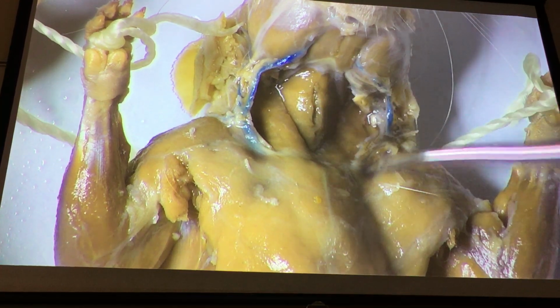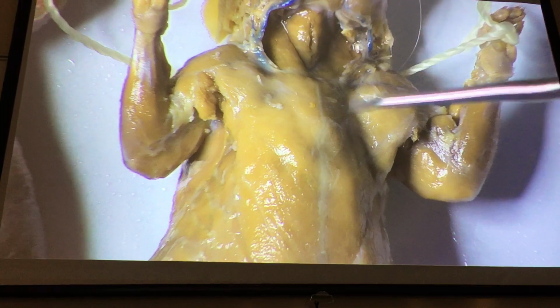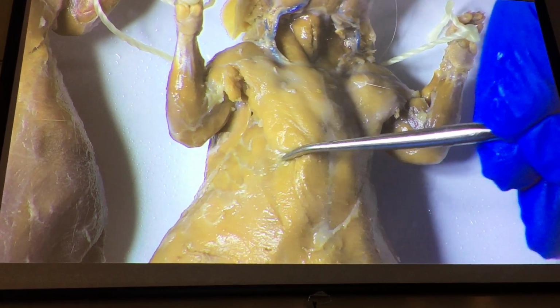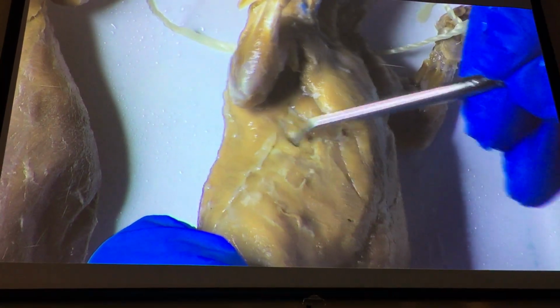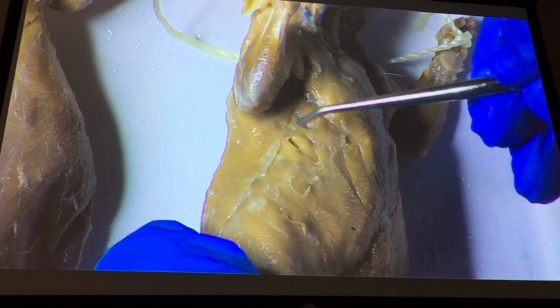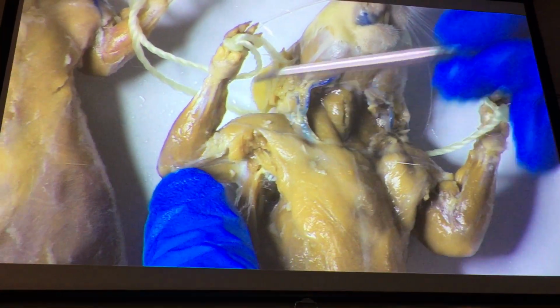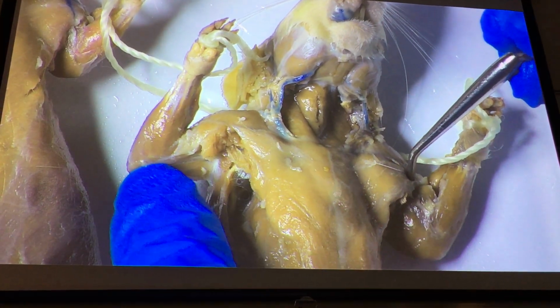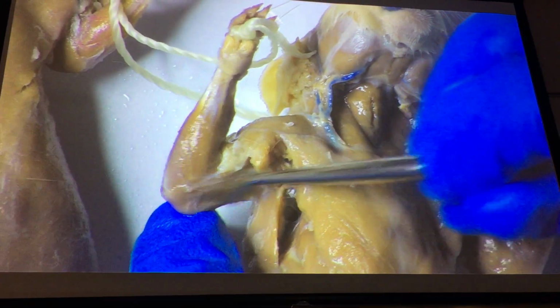All right, continuing on down here. Obviously, pectoralis superficialis, and behind it, pectoralis profundus. Don't forget to be aware of these little muscles here that look like shark gills in the shoulder area. These are the serratus ventralis, right? Latissimus dorsi, going back up onto the arm here, our acromiodeltoid. For some of your animals, it has a nice blood vessel running along it, doesn't it? To separate it from the pectoralis superficialis. And then, of course, we have this little muscle here, the epitrochlearis.